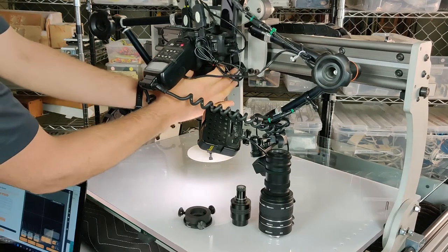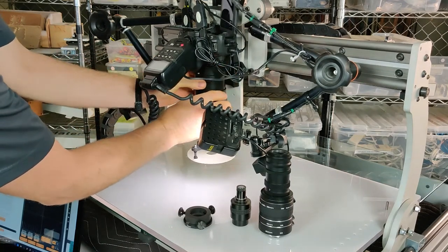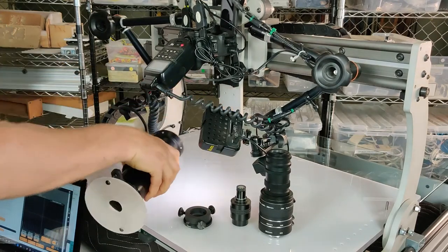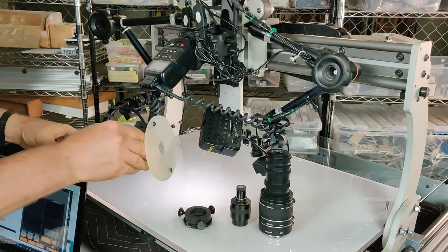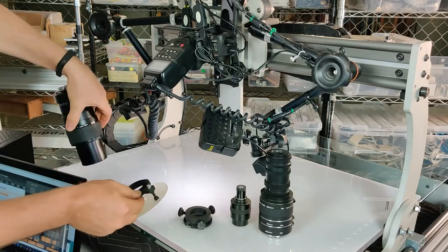I'm going to release the lens with the little switch up here and turn it until it unlocks. Then I can take off the diffuser of the MPE lens.